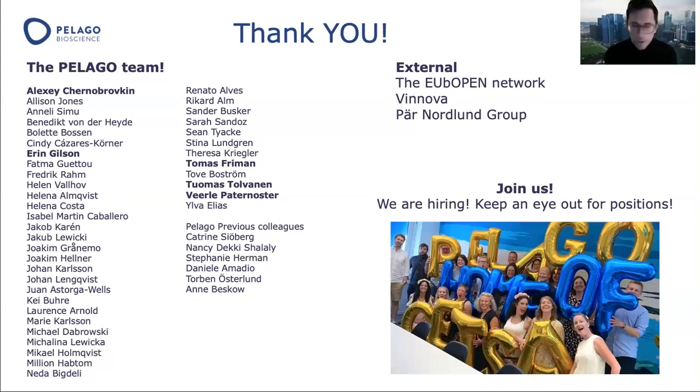Now, when we founded Pelago, we wanted to work quite a lot in the clinic. I see that could happen, or it's happening. I want more of that. I would very much like to have a CETSA machine at every hospital or every clinical laboratory. Of course, I think that we need to be better at working in small sample sizes and be much more economical on the cells for the experiments. Otherwise, we won't access primary cell types and this precious material, for example. I think that imaging CETSA could be quite interesting. I know it's hard, but it could still be very interesting.